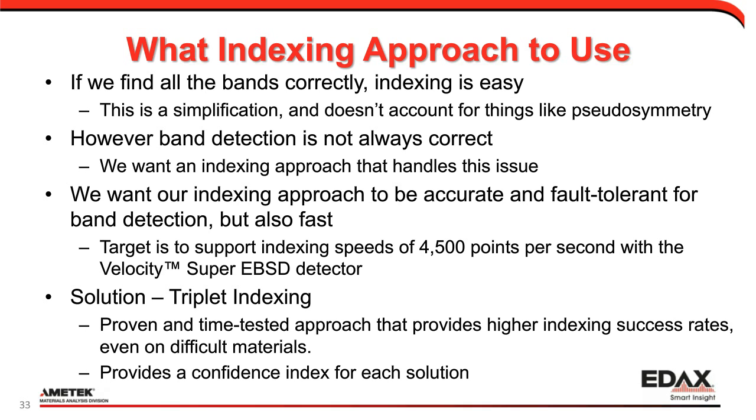But of course, when we're looking at indexing engines, we're always evaluating compared to other alternatives. We're still very happy with triplet indexing. And in addition to that, I'll describe how it provides a confidence index value for each solution.